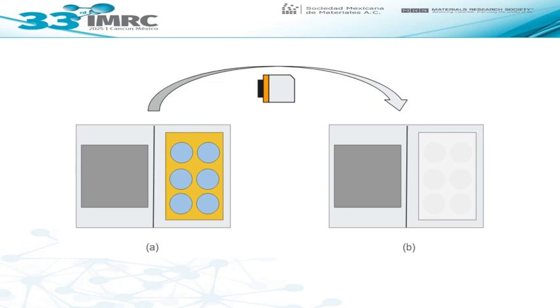This stands for a borosilicate slide with a layer of PTFE coating. Now, this PTFE has a thickness around 200 micrometers. This is how we can create very thin pools of aqueous solutions.